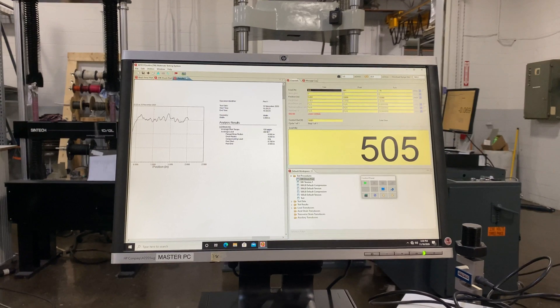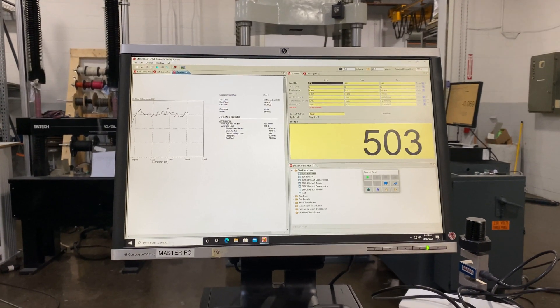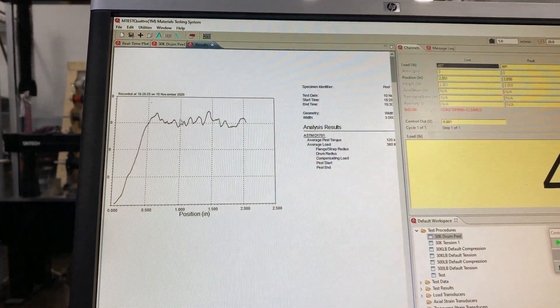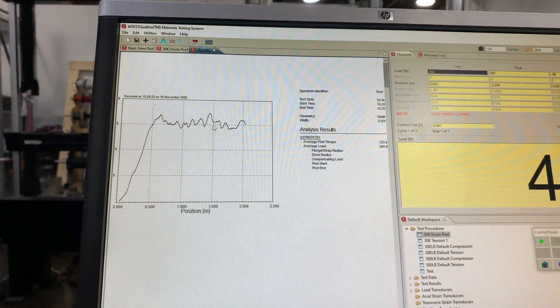You can see the average peel torque and average load. It's taking data across this entire band while it was just pulling the adhesive.